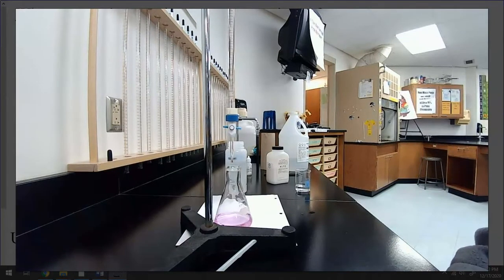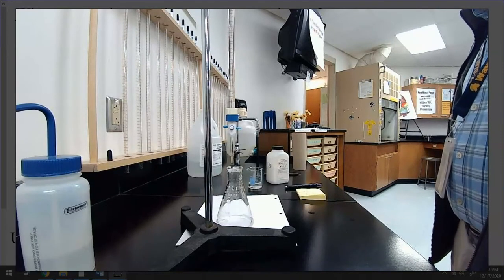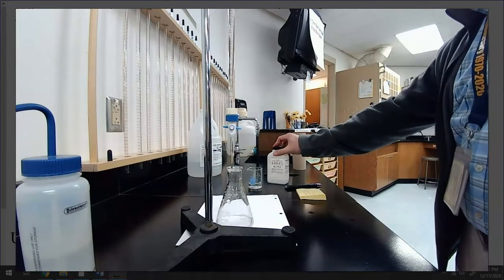So here's what I'm going to do. I'm going to set up a second trial, run it. I won't record it, okay? And then I'll give you the data for both trials of the unknown acid A. All right, I am set up for my second trial of unknown A, okay?